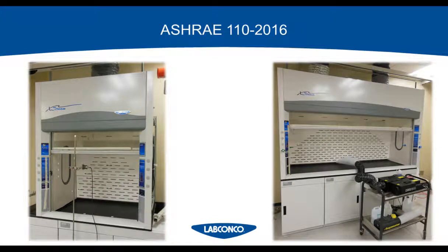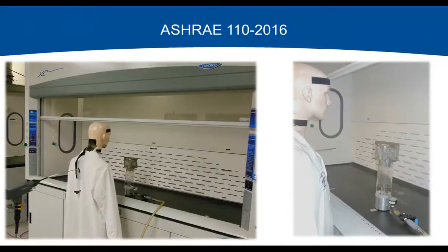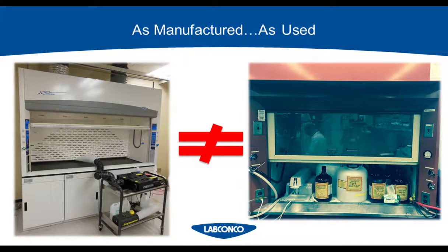So just to give you a peek at how ASHRAE 110 looks, on the left we've got the face velocity profile test, which is done at multiple points along the sash plane. And then you've got the visualization test on the right-hand side. And then we're showing the tracer gas, which gives the parts per million containment of the fume hood based on those parameters. But what you'll notice here is that there's not a thing in the hood.